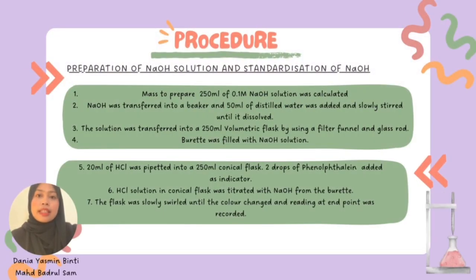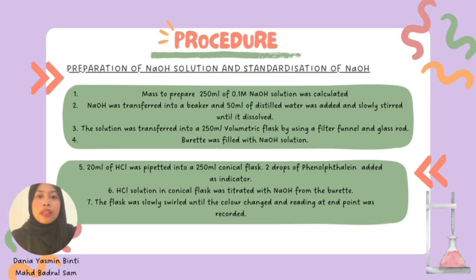Preparation of sodium hydroxide solution and standardisation: the process to prepare 250 mL of 0.5 M NaOH solution was completed. NaOH was transferred into a beaker, 50 mL of distilled water was added and slowly stirred until dissolved. The solution was then transferred into a 250 mL volumetric flask using a filter funnel and glass rod. The burette was filled with NaOH solution, and then 20 mL of hydrochloric acid was pipetted into a 250 mL conical flask. Two drops of phenolphthalein were added as an indicator, and the HCl solution was titrated with NaOH from the burette, swirling until the color changed, and the endpoint reading was recorded.